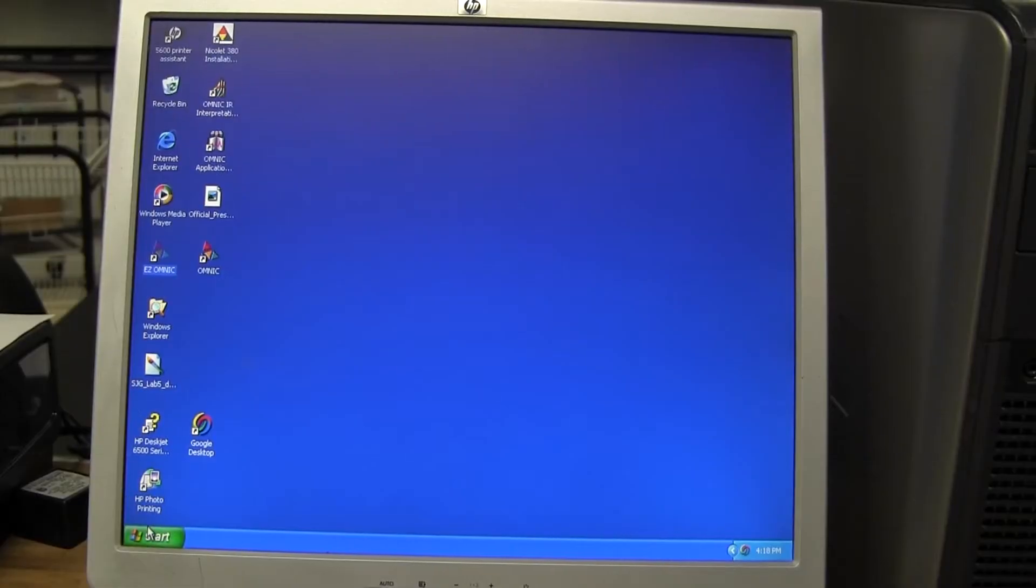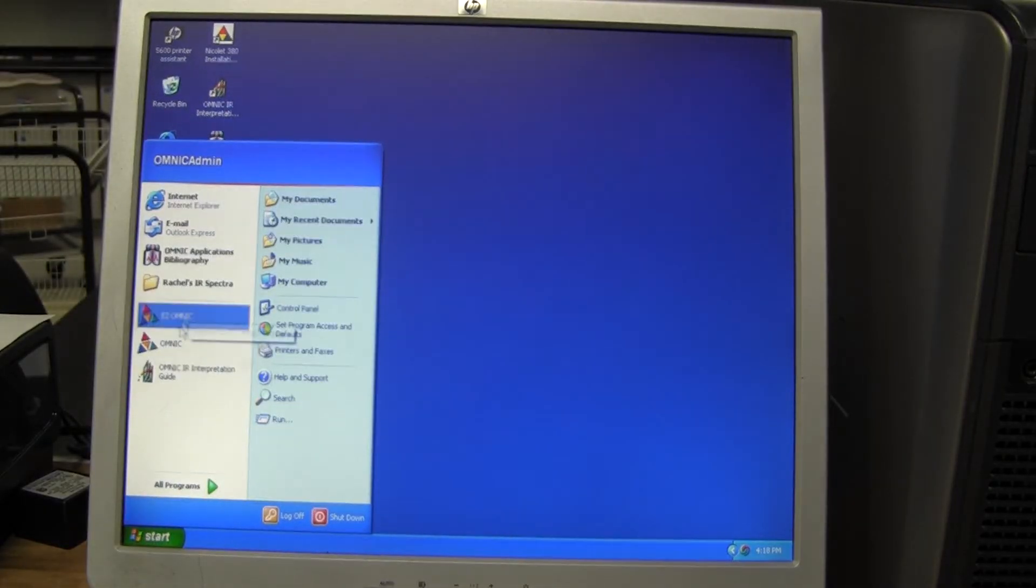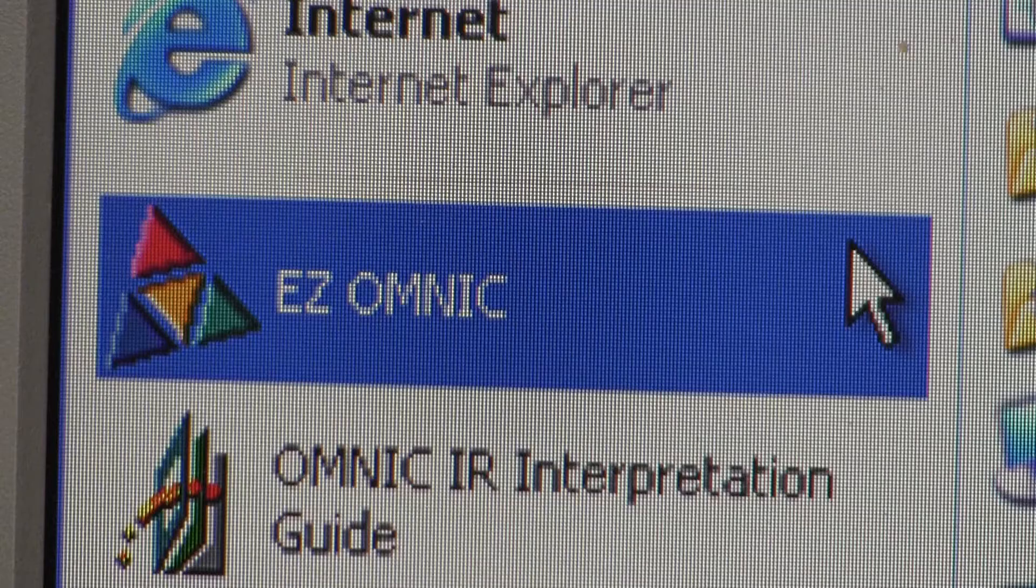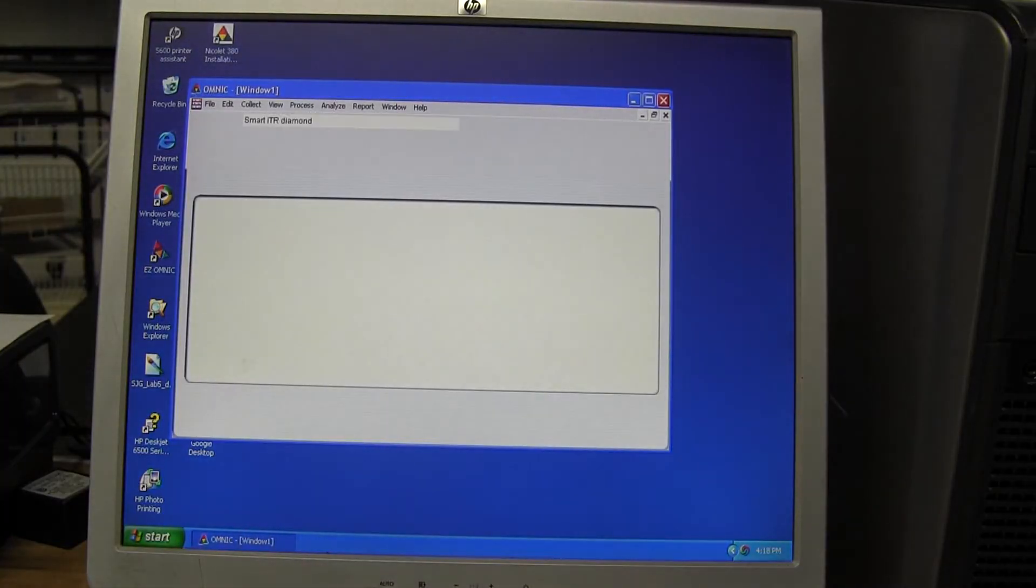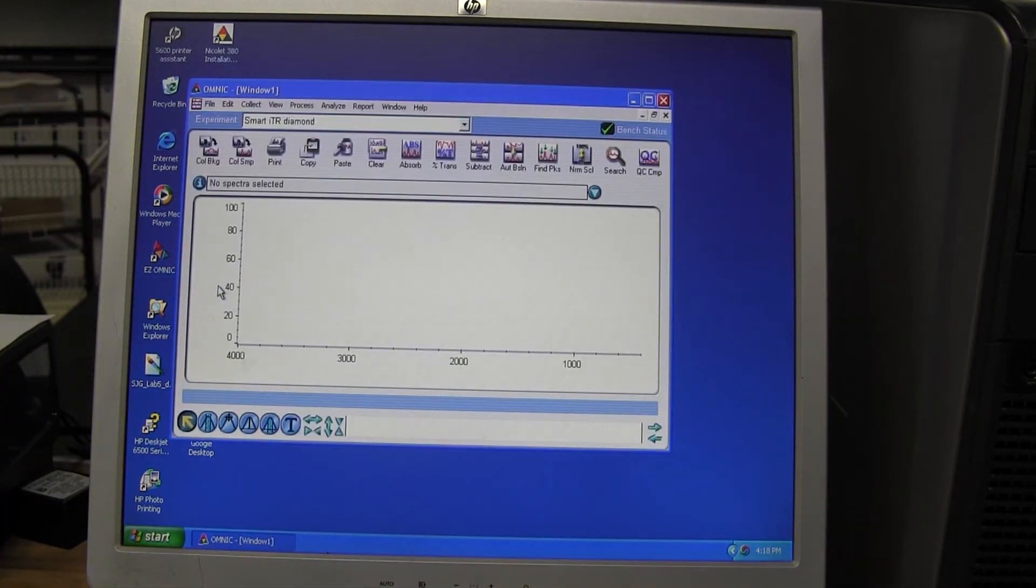Now we are ready to collect data. If the program is not opened, select the program OMNIC from the window menu. If a pop-up about the crystal comes up, select OK.